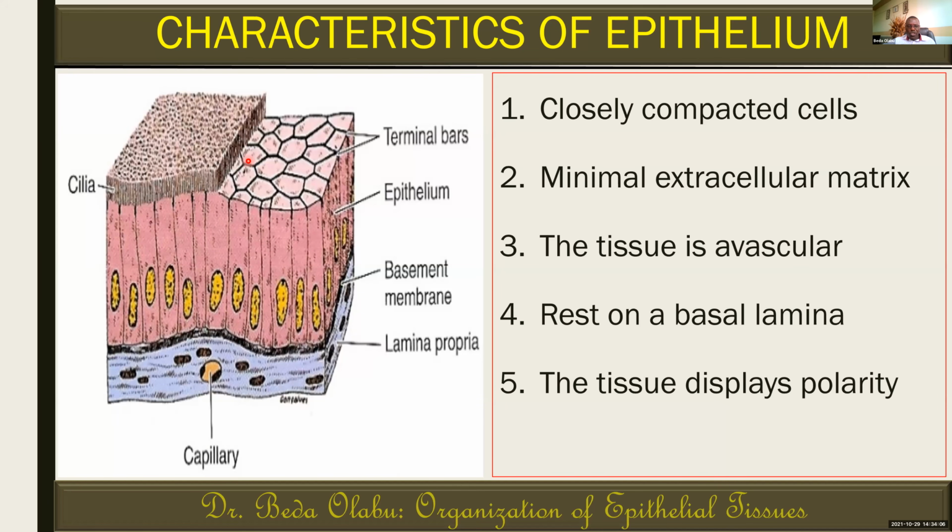However, from histologic perspective, from a morphological perspective, of course, you can't see the directionality. So what do we see? What we see is that the epithelium is resting on a surface, and by it resting on a surface, there's a part of the epithelium that is attached. We call that the basal surface. And there's a part of it that is free. We call that the apical surface.